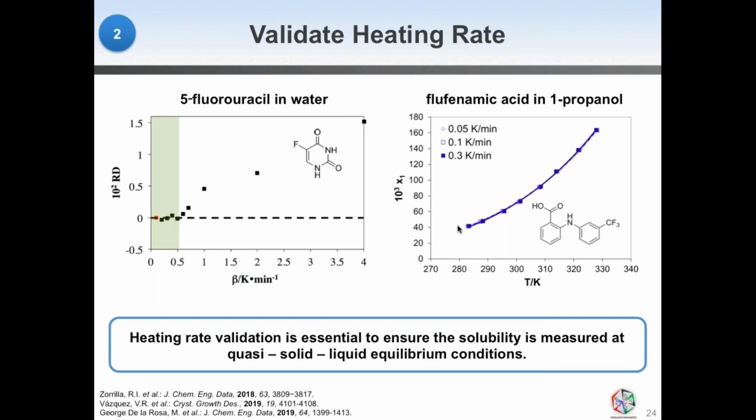Another question. Do you have recommendations for measuring the solubility curve of mixed components, salt and API in solution, for example? Is Crystal16 able to aid that? Or any other way to do it? Of a salt crystal or a salt and a crystal? I'm not sure. Yeah, salts and API in solution. Maybe they mean both the neutral form and the salt form?